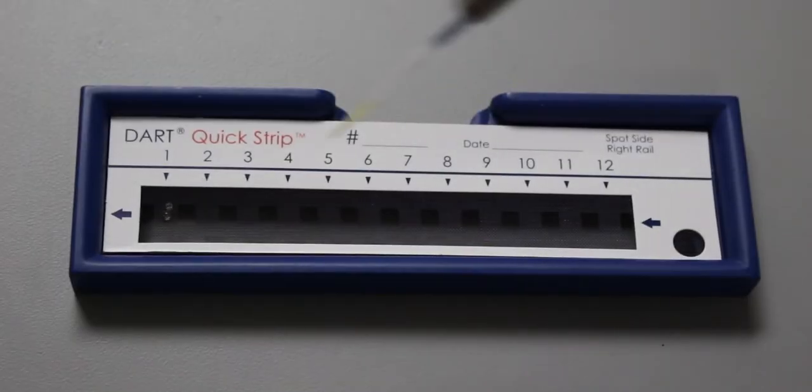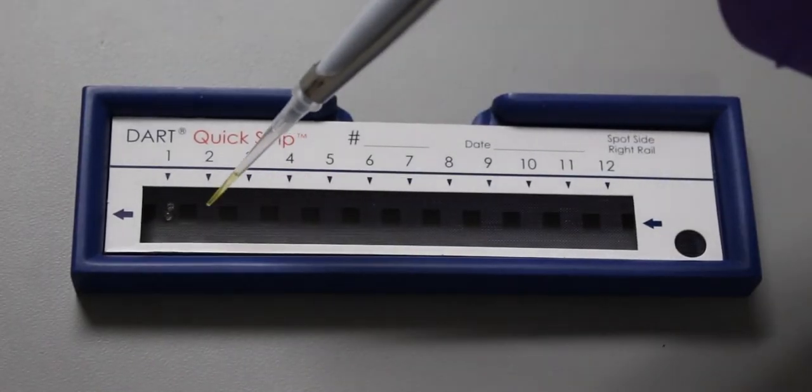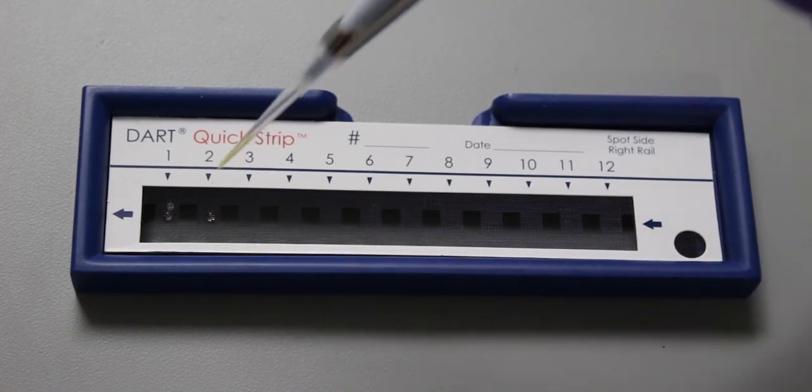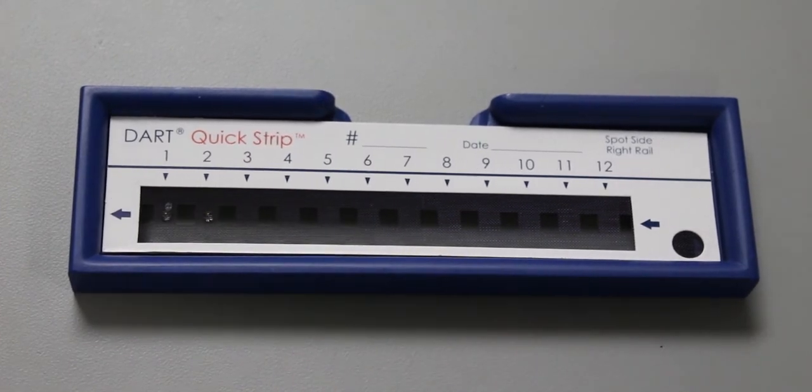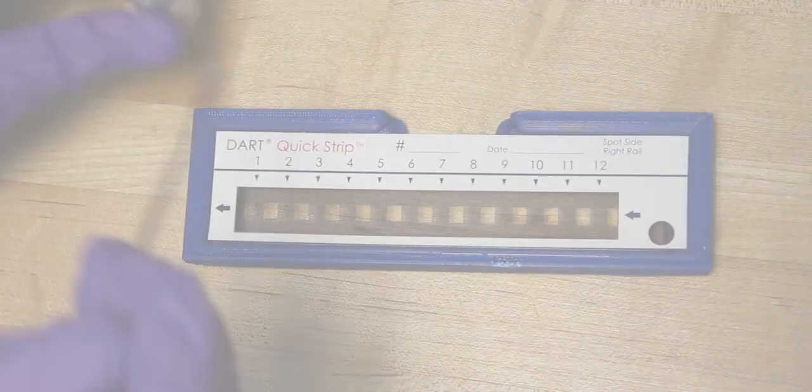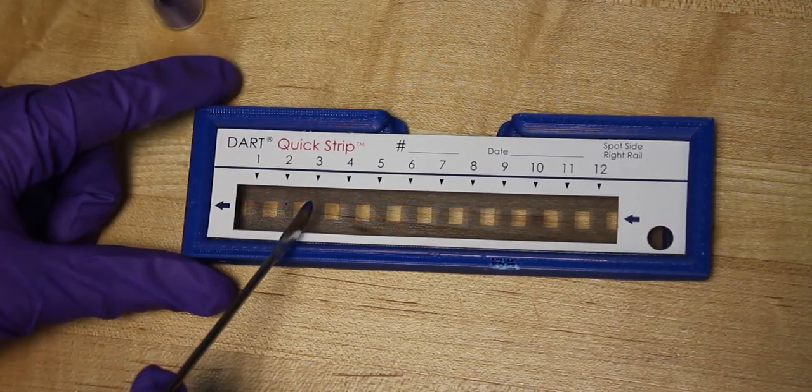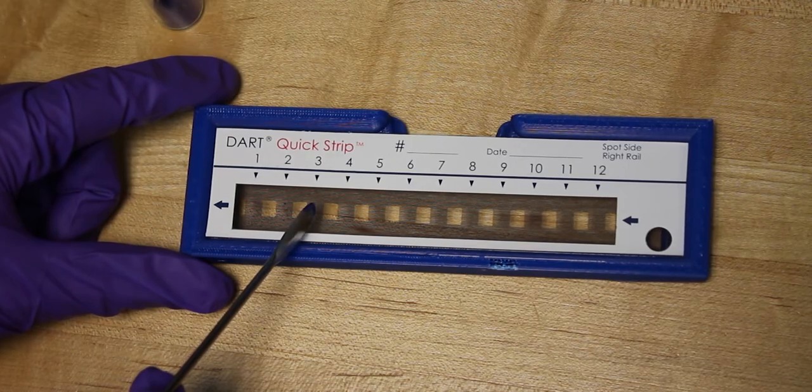You can deposit liquid samples onto the mesh spots, usually between 1 to 5 microliters, or you can scrape powder or solids onto the sample spots as well.